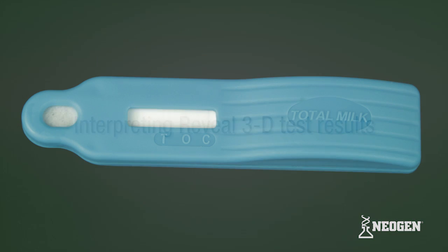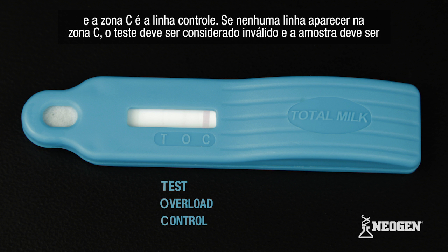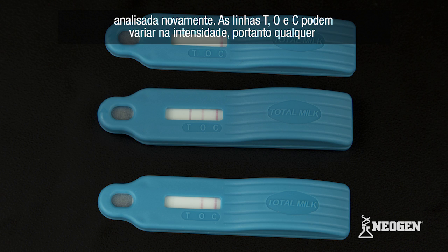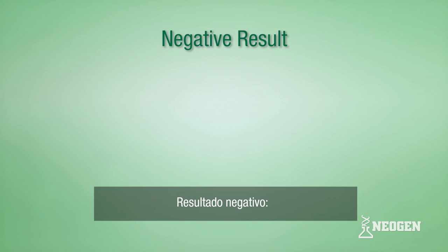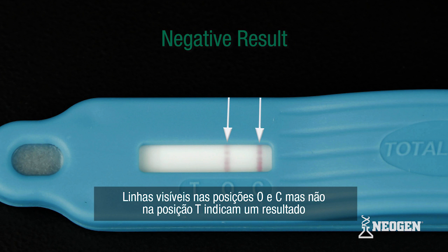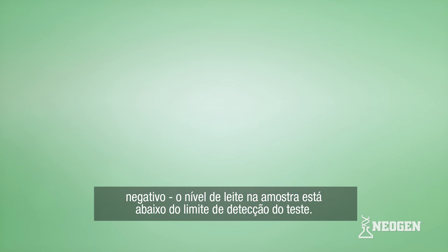When interpreting Reveal 3D test results, note the device's T, O, and C zones. The T zone is for the test line, the O zone for the overload line, and the C zone for the control line. If your device does not develop a control line, the test should be considered invalid and the sample should be reanalyzed. T, O, and C lines can vary in intensity; therefore, any intensity of the line should be interpreted as a line. For a negative result: lines visible at positions O and C, but not at T, indicate the level of milk in the sample was determined to be below the test detection limit.